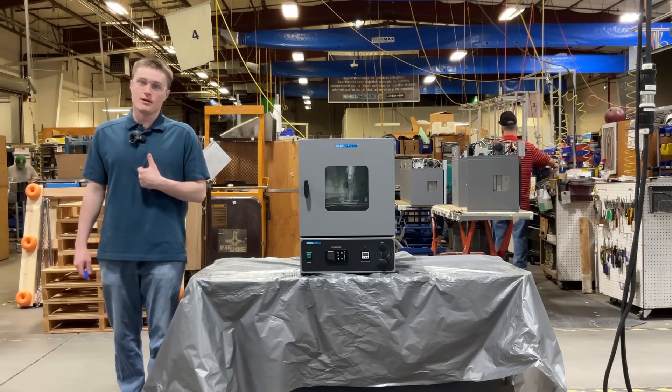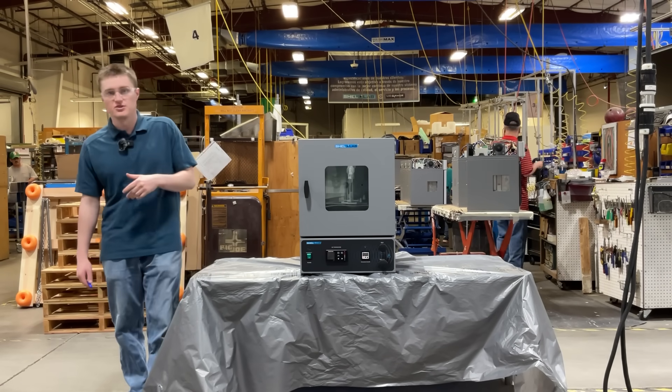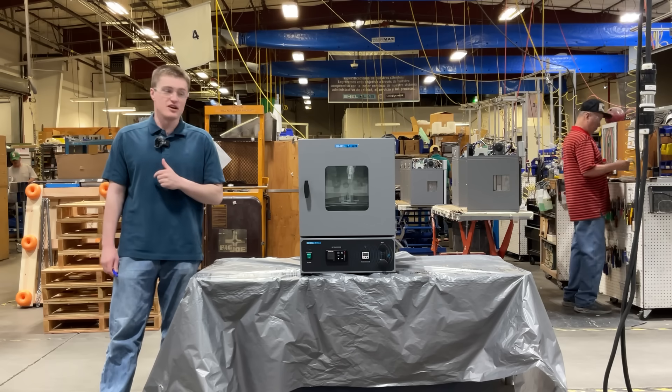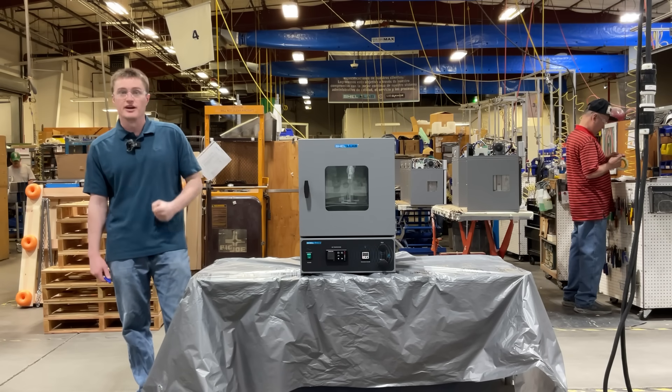Hello again, my name is Kord Sankseek. I'm a design engineer here at Sheldon Manufacturing, and today I'm going to be introducing the S-Vac-1 Vacuum Oven — a game changer for life science research, material scientists, and industrial professionals who demand controlled, contamination-free drying, curing, and processing.